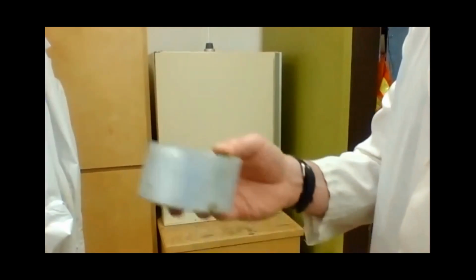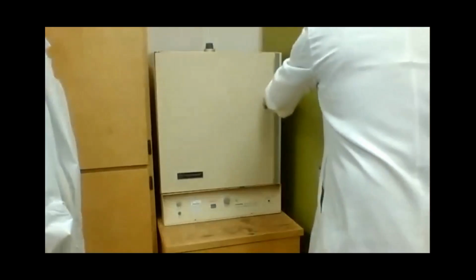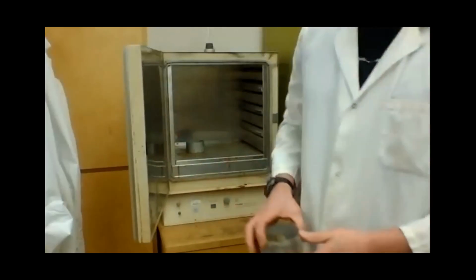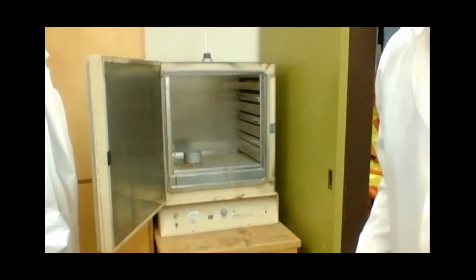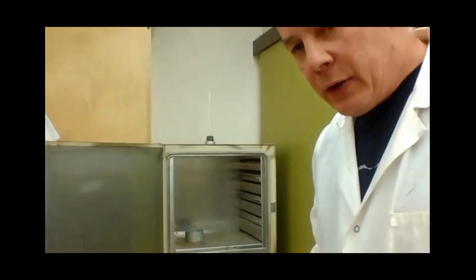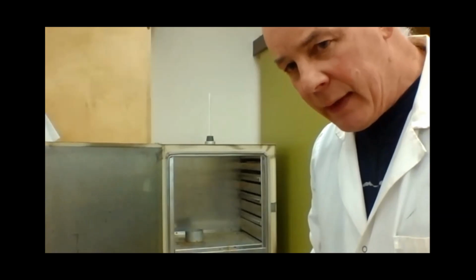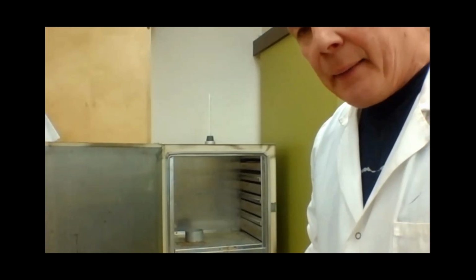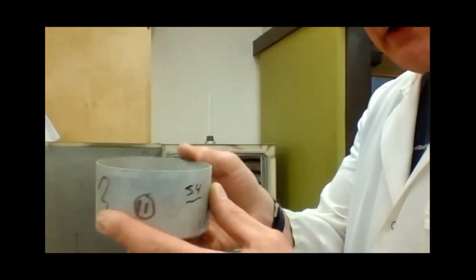There we go. So far, so good. So here's the sample. Going to put it into the drying oven. We're going to dry it for 24 hours at 110 degrees C, and that's going to take all the moisture out of the sample. And I've had a sample in there overnight that I took yesterday as well.